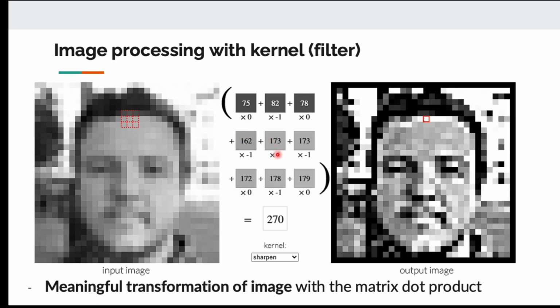So you're basically amplifying the center, and you are reducing the signal from the surroundings. So you multiply everywhere in the image with this 3x3 matrix, with coefficients like 0, -1, 0, -1, 5, -1, 0, -1, 0. So basically, it's going to amplify the central pixel by 5-fold, and then subtract the sum of the 4 adjacent pixels, and then ignore the corner pixels entirely.